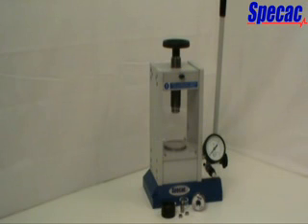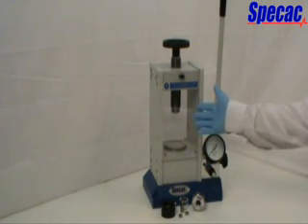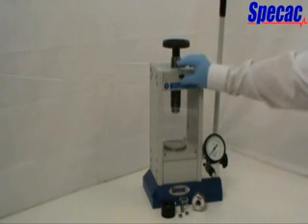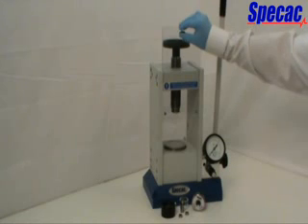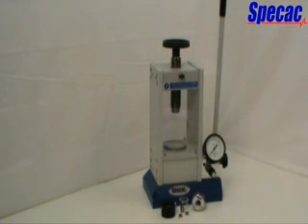The 15-ton manual hydraulic press works by pumping oil as a hydraulic fluid to raise a pressing piston and compress a sample held in the pressing area. The pressing area features front and rear safety guards which help for safe containment of any work being pressed within, should an explosive event occur from the high forces that are being generated.